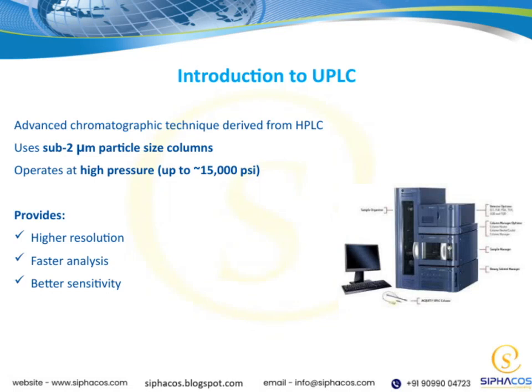UPLC stands for Ultra Performance Liquid Chromatography, and it's an advanced chromatographic technique that actually evolved from traditional HPLC, or high-performance liquid chromatography. The key difference is that UPLC uses columns packed with very small particles, specifically less than 2 micrometers in size. This small particle size is critical because it allows for more efficient separation of compounds. Another important aspect is that UPLC operates at very high pressures, up to around 15,000 psi, so the system can push the solvent through these tiny particles quickly and effectively.